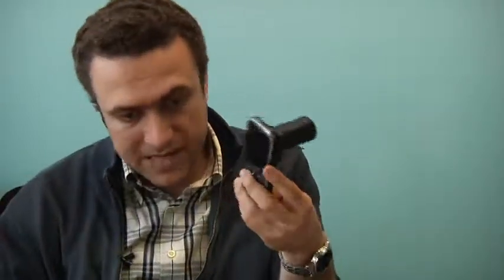It's textured. Then what we do is we take those shadows, process them, and digitally focus them back to where they are located. That digital focusing is the same thing that the lens does, except it's done through computation. This way you can actually create images that can look at large areas of, for instance, blood smear, and look at cell morphology at a resolution that is half a micron, 1/2,000,000th of a meter resolution scale, using computation. That's how this lens-free microscope works.